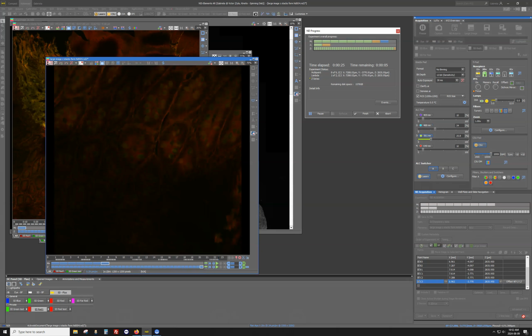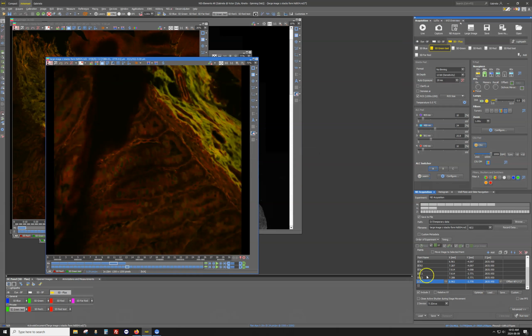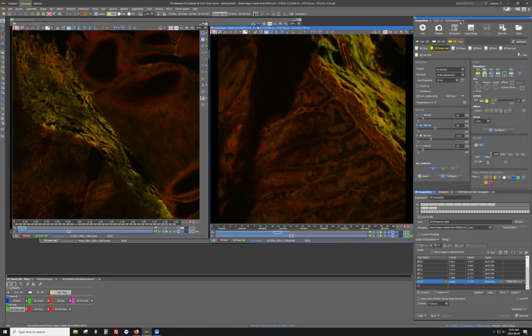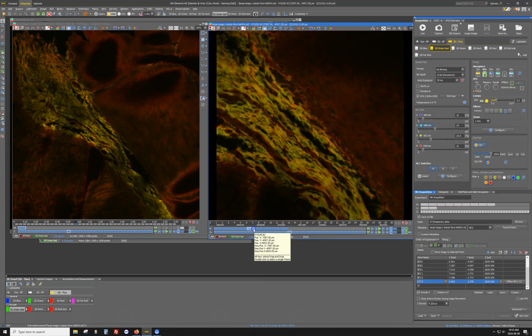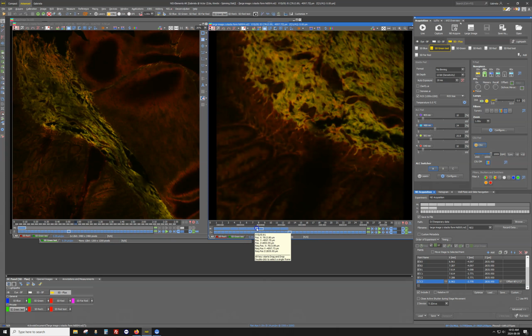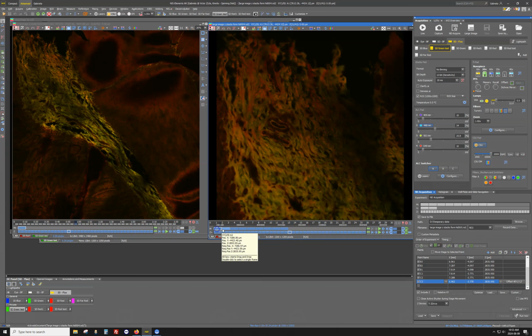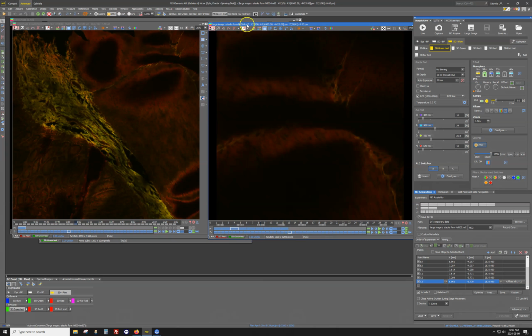As you can see, it goes very fast, and it will take around 29 seconds to finish it. And here you can see the Z stack, which for each of the individual positions, which are actually your tiles, which we will use to assemble your large image. How to assemble this into a large image?